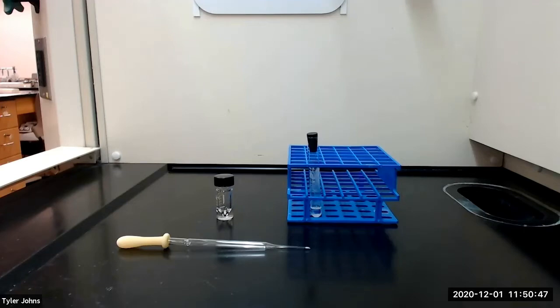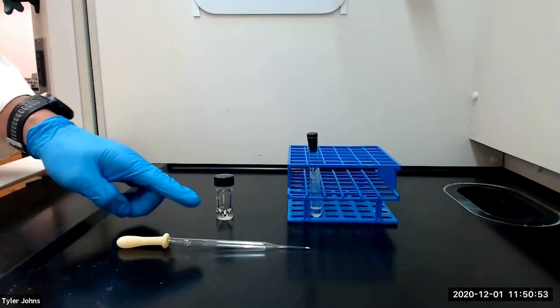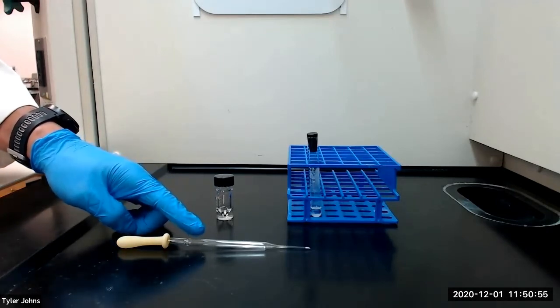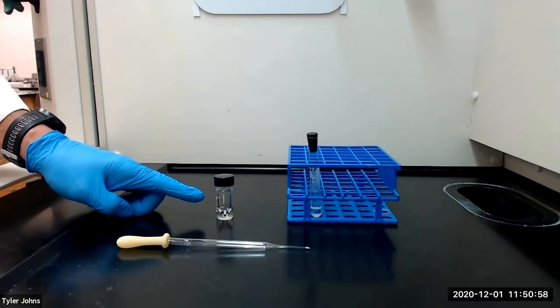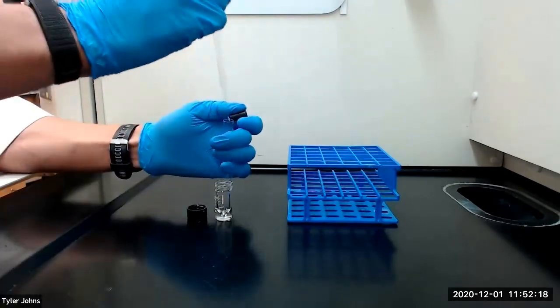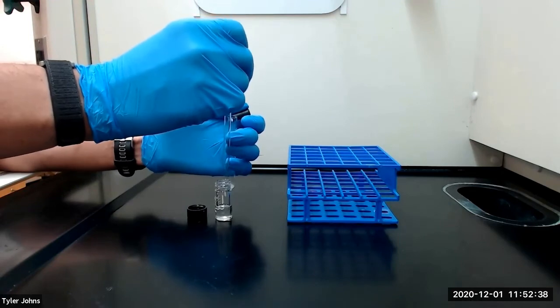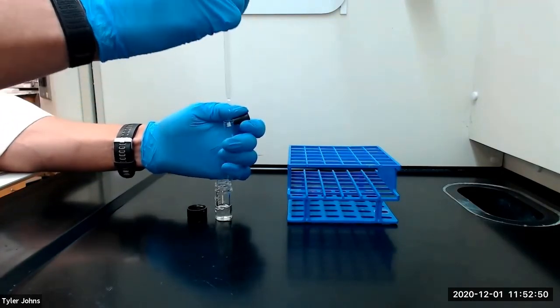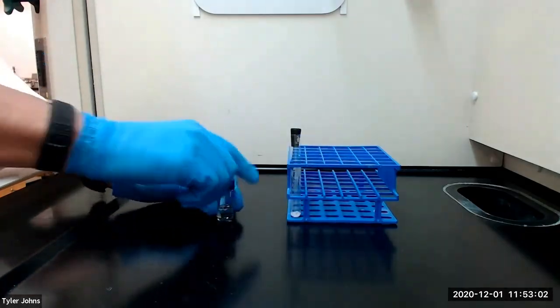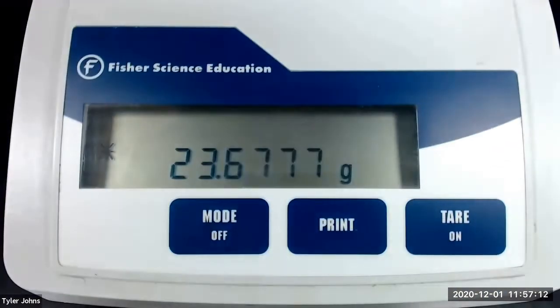After drying for 15 minutes, we will next transfer the 4-methyl cyclohexene to the pre-weighed 3-milliliter conical vial using a filter tip pipette. We will then determine the mass of the pre-weighed 3-milliliter conical vial plus the 4-methyl cyclohexene. The mass of the pre-weighed 3-milliliter conical vial plus the 4-methyl cyclohexene is 23.6777 grams.